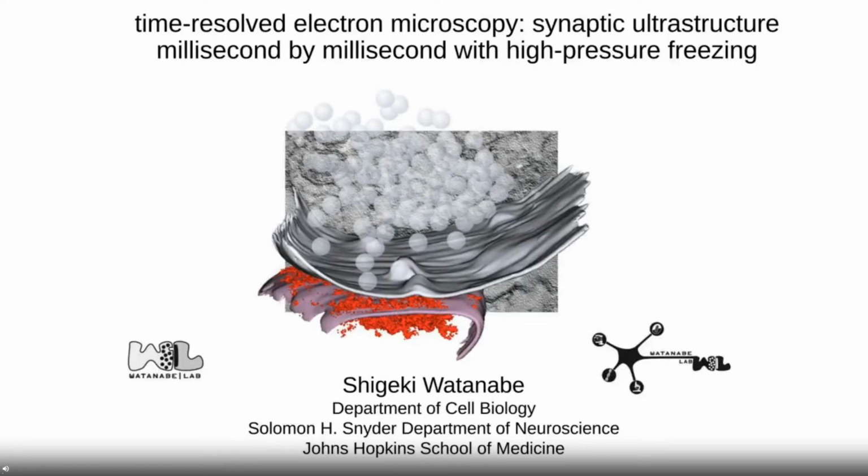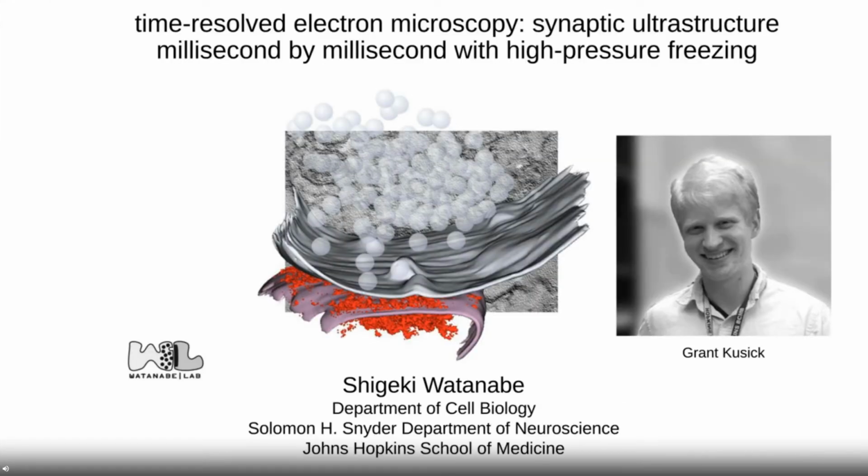Okay, so thank you so much for such a nice introduction, and thank you all for tuning in today. I'm Shigeki Watanabe, and I'm an Associate Professor in the Department of Cell Biology at Johns Hopkins. And today, with my graduate student, Grant Kusick, we are going to talk about high pressure freezing and how we are using this technique to look at membrane dynamics at the synapses using electron microscopy.